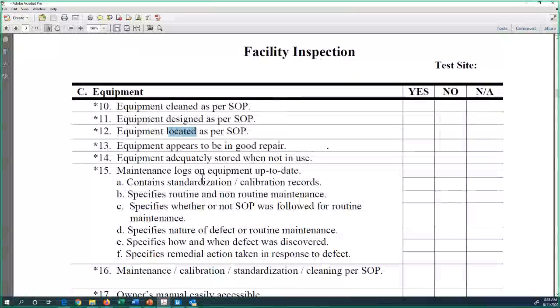You don't bring this everywhere. If it is a small thing like a pipettor, yeah, it's fine. But for the LC-MS, I don't think you will need to carry this around every week, unless it's portable equipment. Okay, then it's a good thing. Okay, and we'll say, okay, the maintenance here. You should have standardization and calibration.